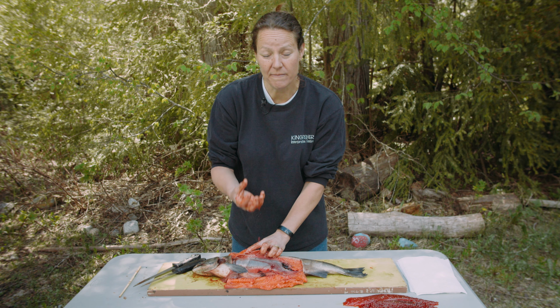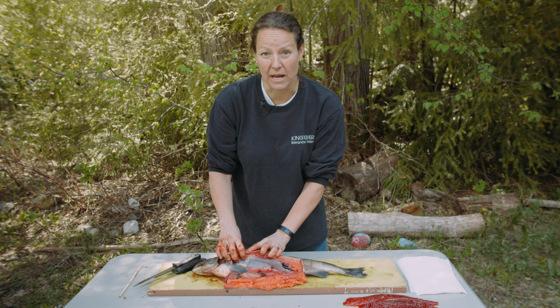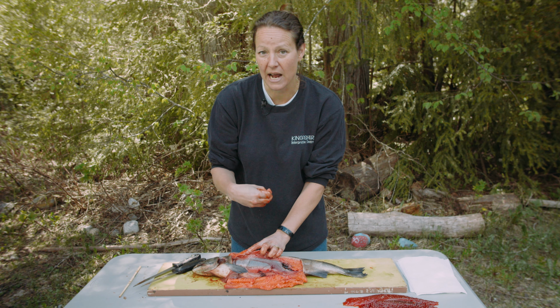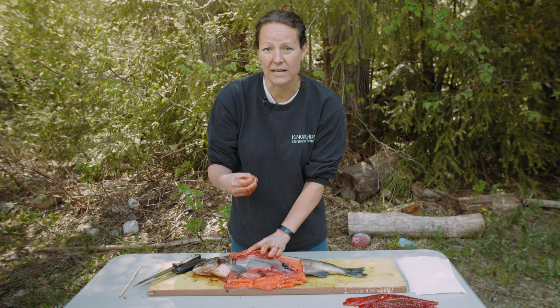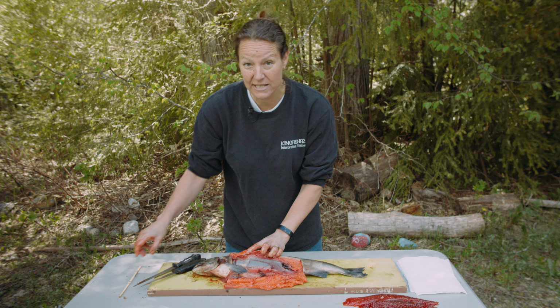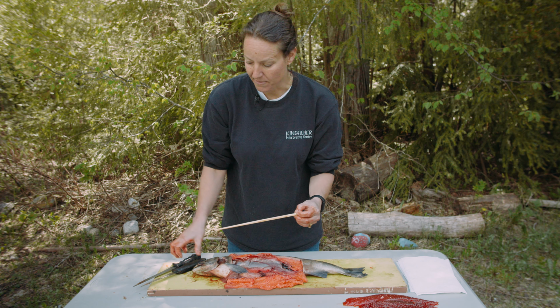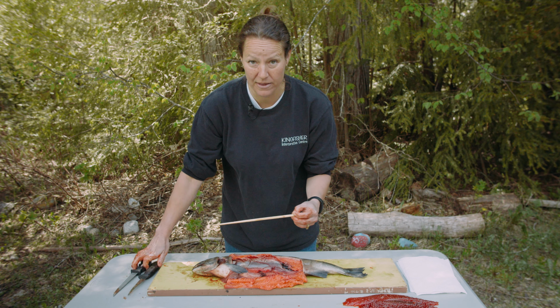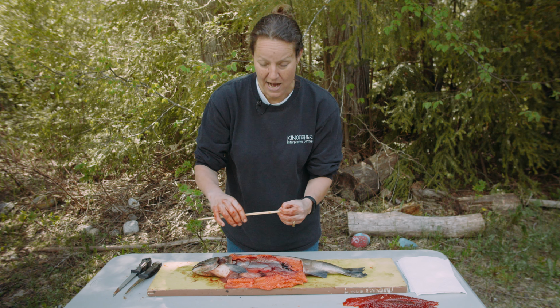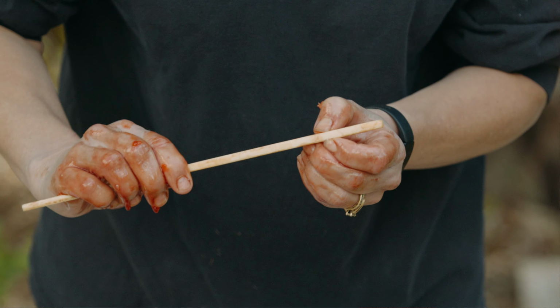So the digestive system is responsible for removing the nutrients and taking the energy out of the food. These fish are cold-blooded. They aren't warm-blooded like us, so they don't require as much energy to stay warm as humans do. But let's see where the food ends up. I'm going to use my chopstick again. I'm going to put this down the fish's mouth, into its throat, and it will end up in the fish's stomach. And we're going to learn something interesting about that.